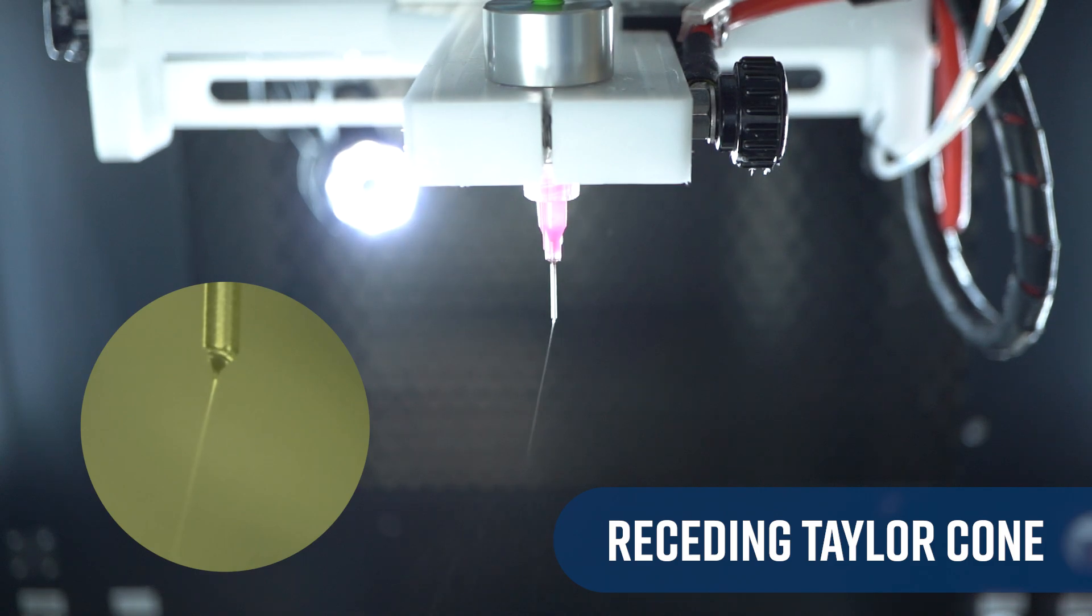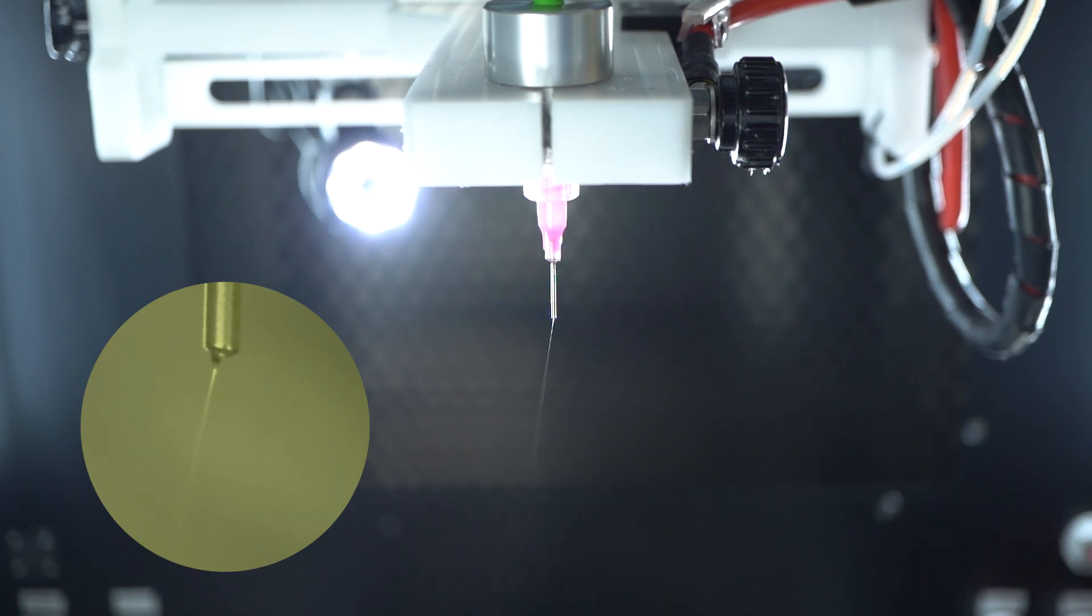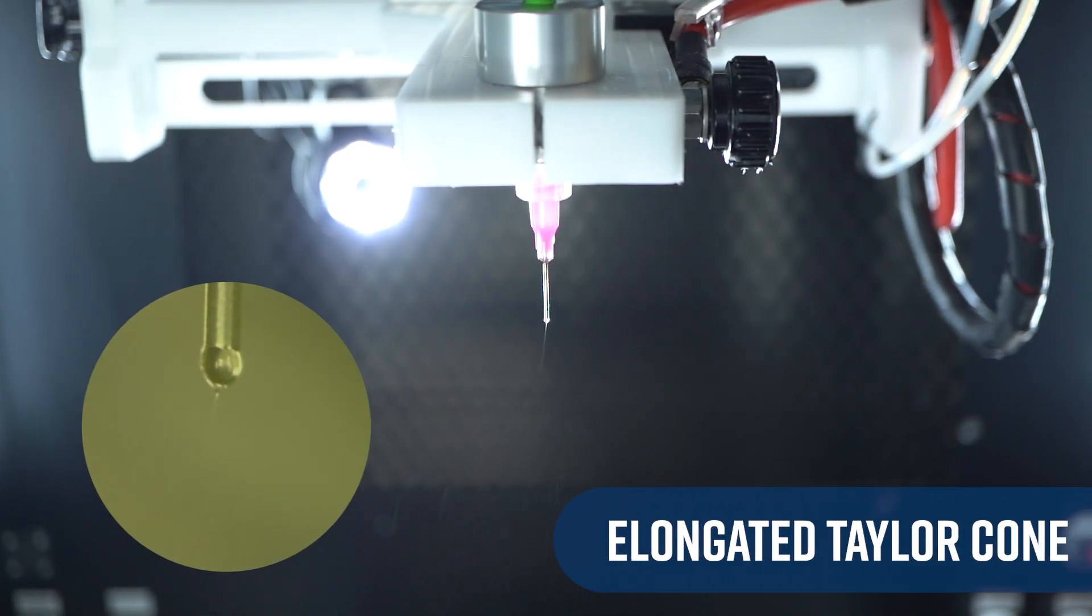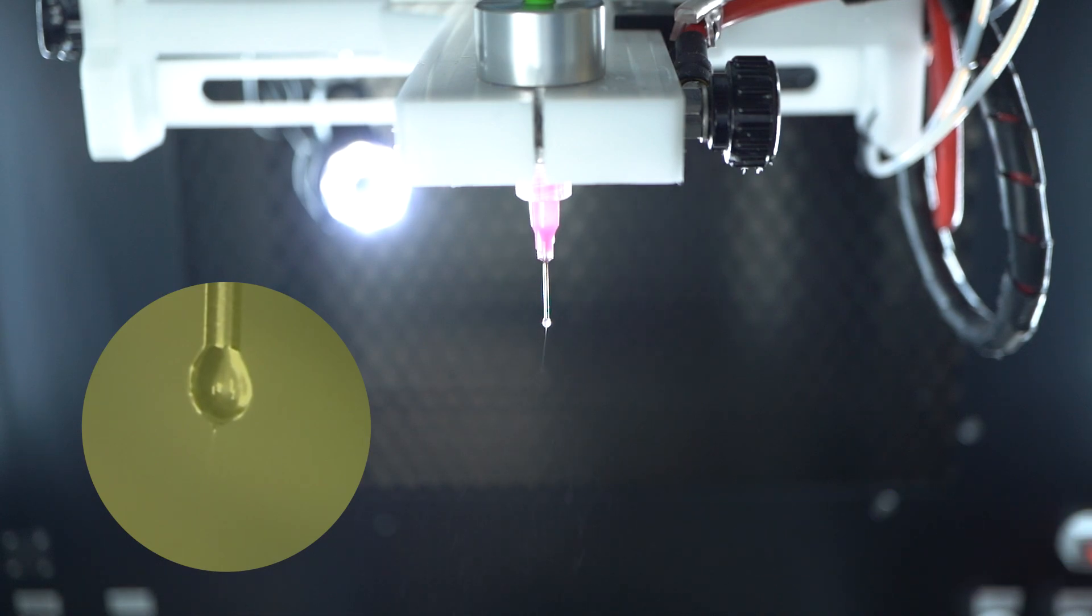In another case, if we have an elongated Taylor cone or dripping, we may see defects in our sample like drips, holes, and variation in fiber diameter sizes. In both of these cases, we should consider adjusting parameters like flow rate, voltage applied, and working distance, assuming our solution is optimized.